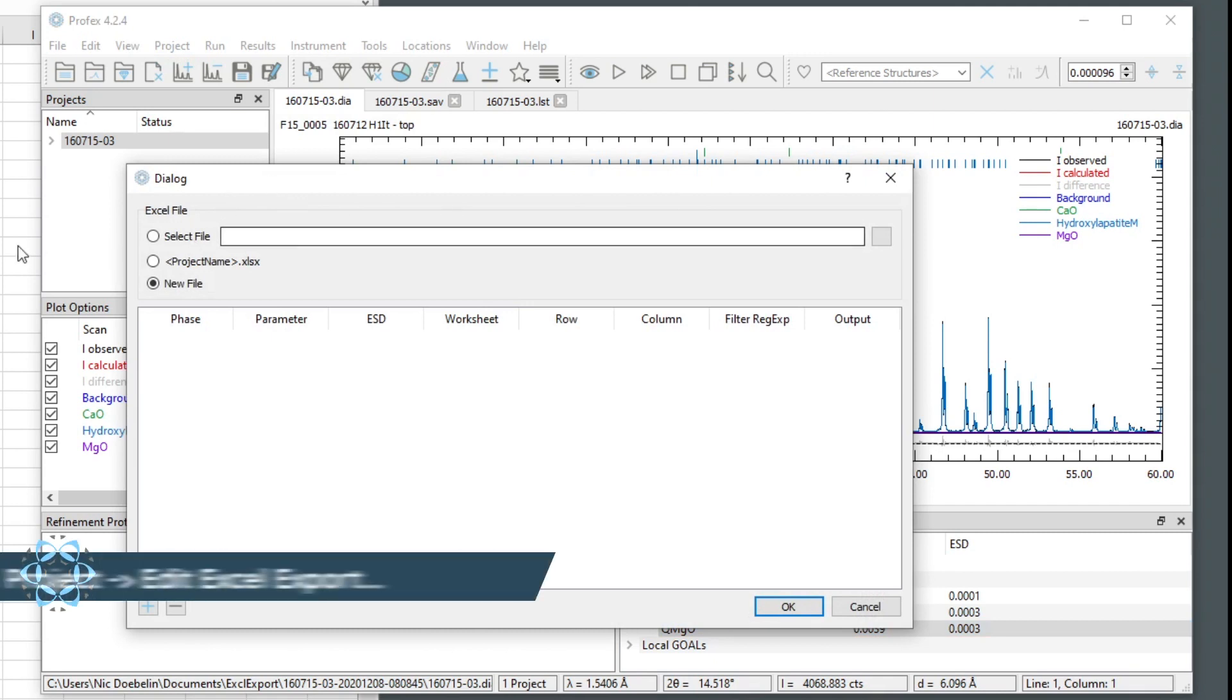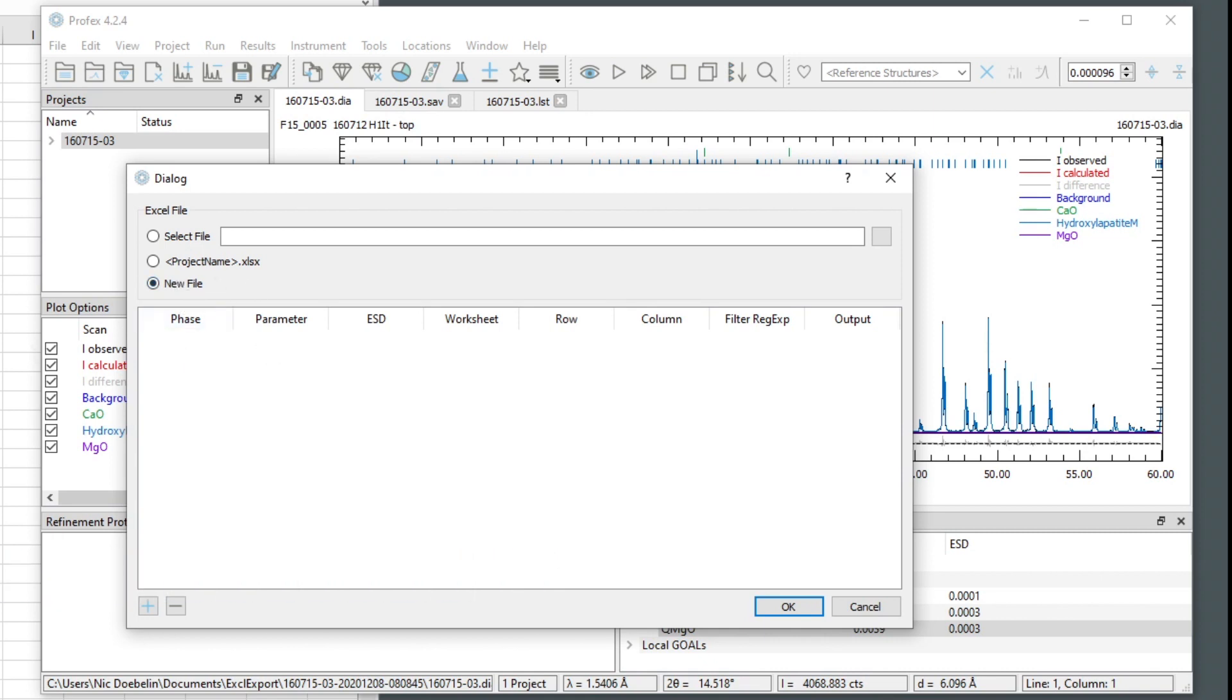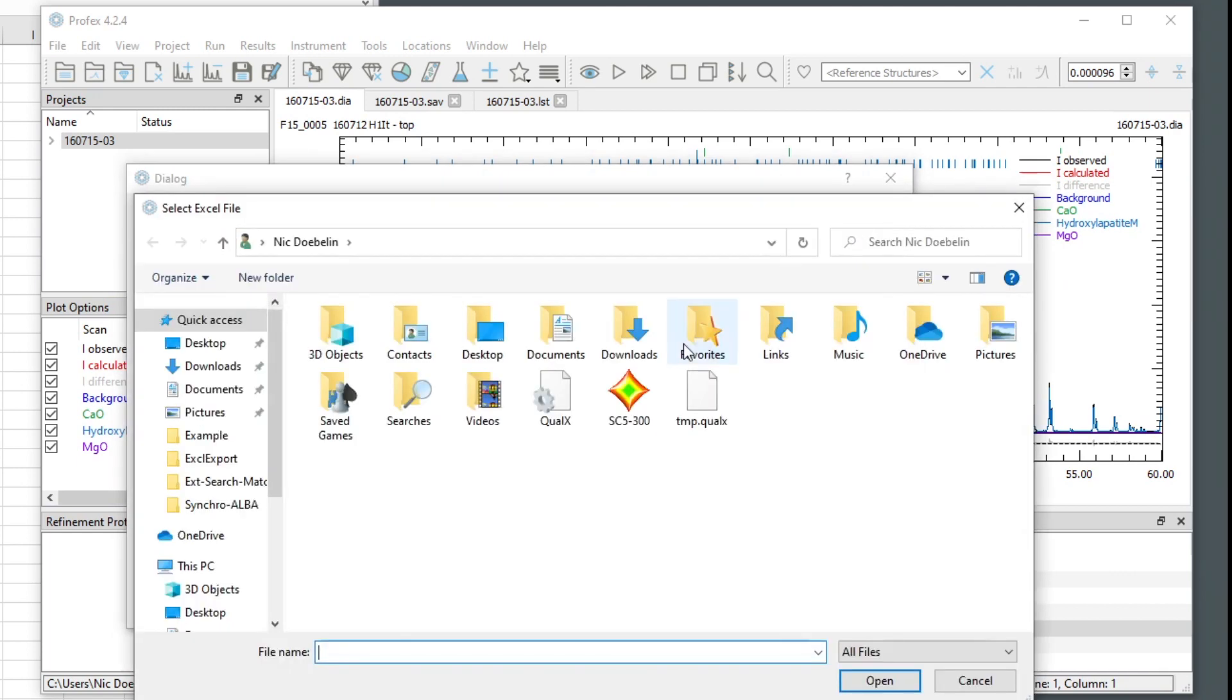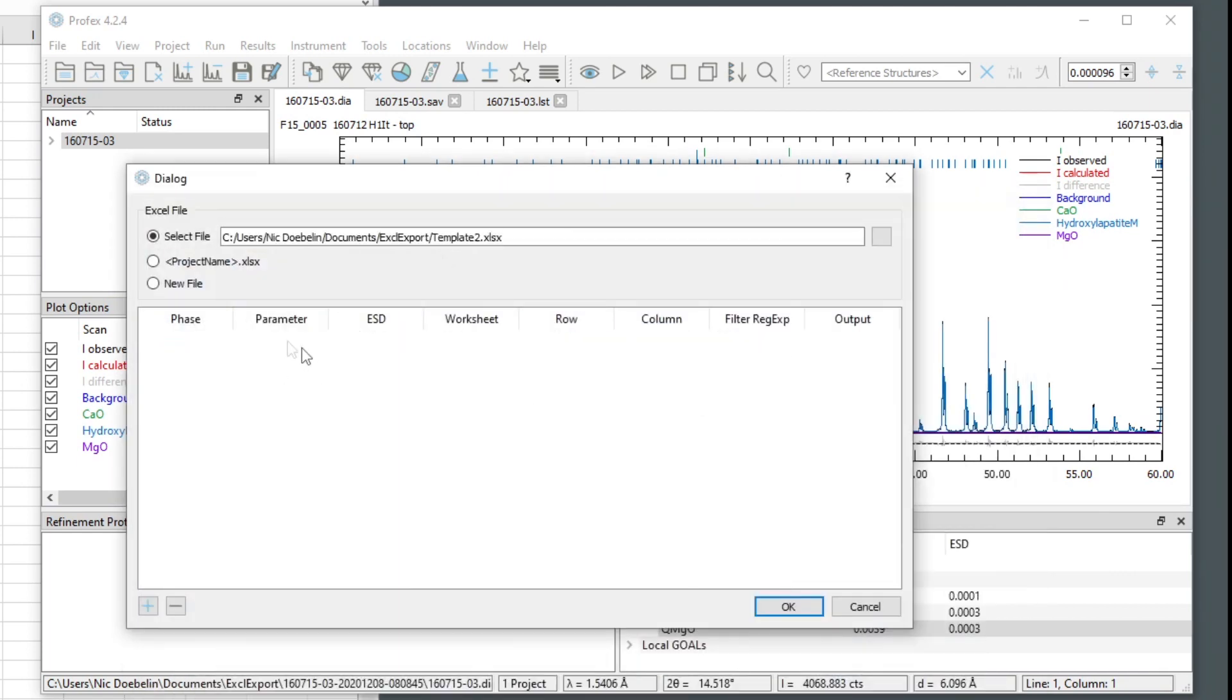And first, we want to specify to which template file we want to export the results. We could choose a new file, and it would always start with an empty spreadsheet. But since we prepared this template, we want to select it on the hard disk. And then we can set up the results we want to export to this template.